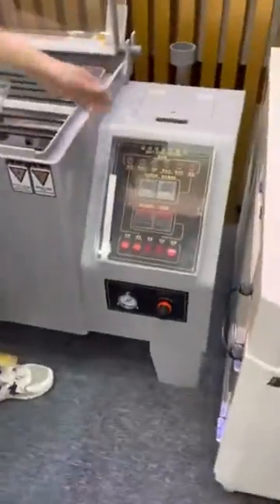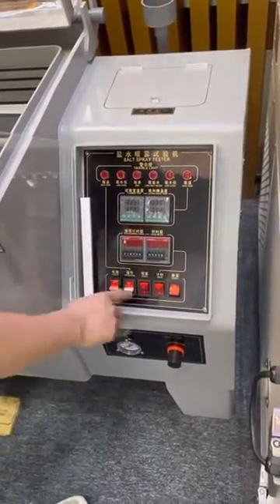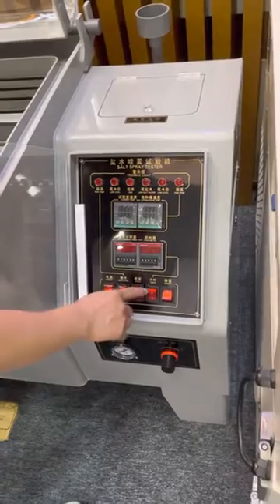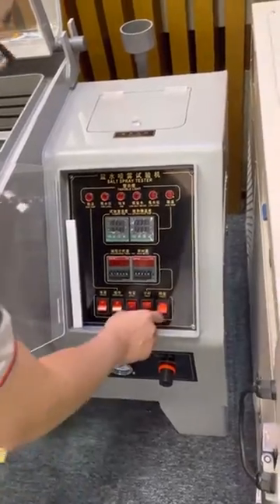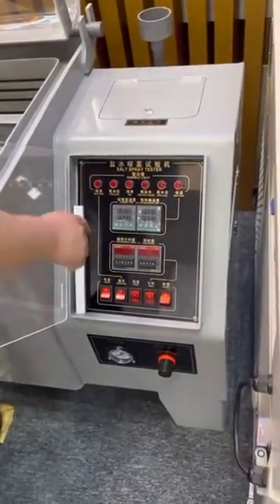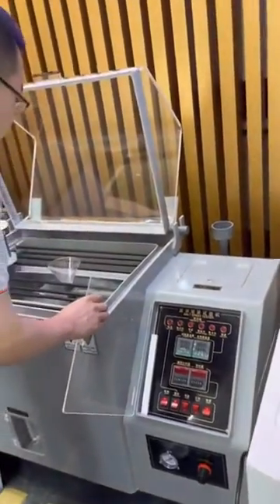This is the control. You can open this power. This is the operation. This is a spiral control. This is the time. This is the display — this is the high temperature indicator. When the temperature is high, this light will show you, then you can control the temperature.